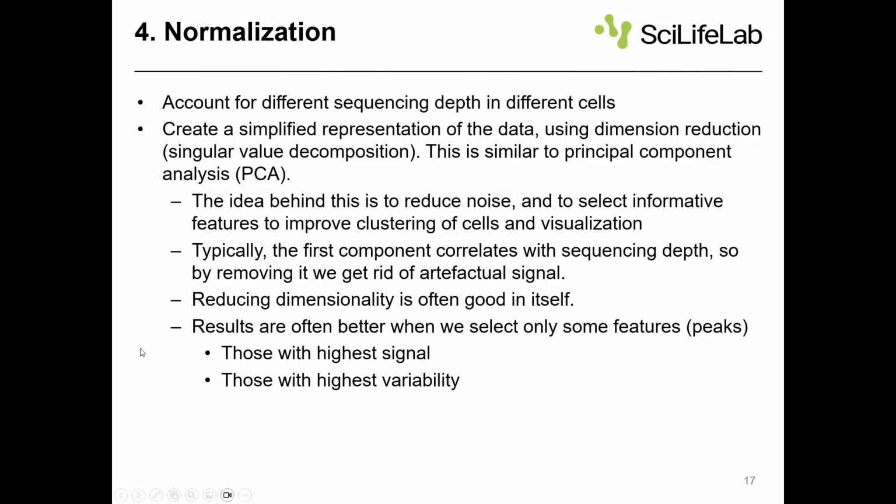And this is often like for single cell RNA-seq. There are many parameters you can tweak, and you can play around with this. For example, which of these peaks you want to include, how many, if you want to choose the ones with highest signal or most variability in your data. This is an iterative process, right? You tweak these things until you come up with something that you like and makes sense. It's a bit subjective in the end.